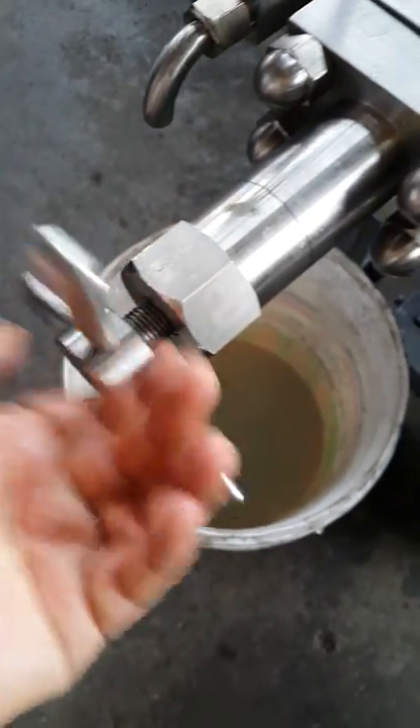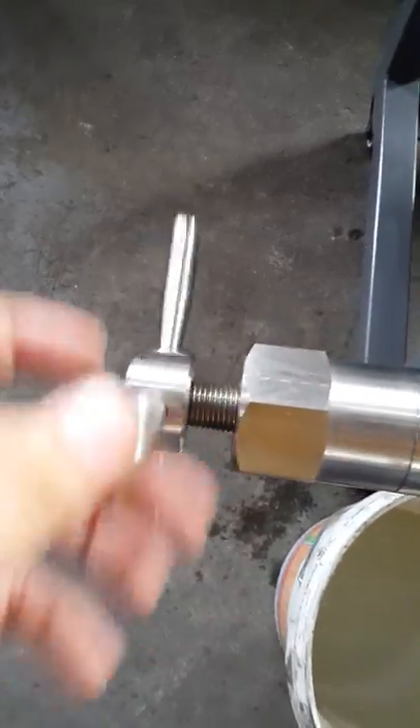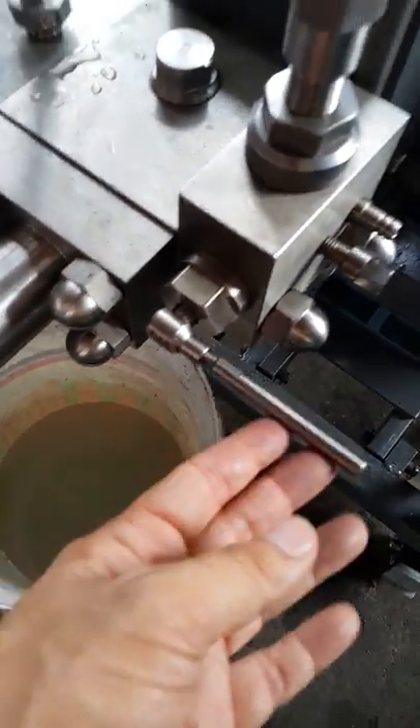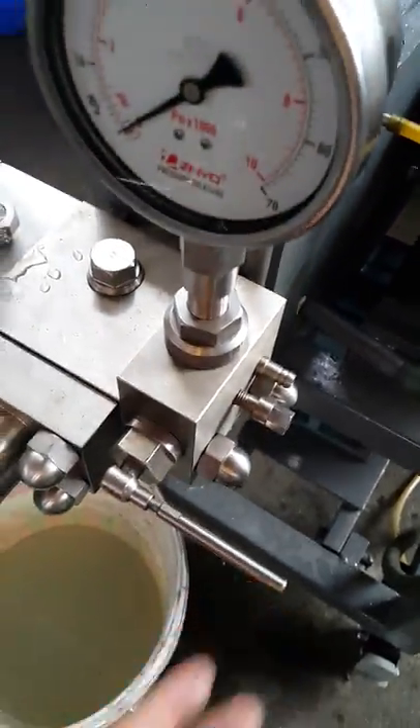A beginner must release the valve — this is very dangerous. The two valves must be released. This one here, no need; it is already in open position. Open position is the gate valve open position.